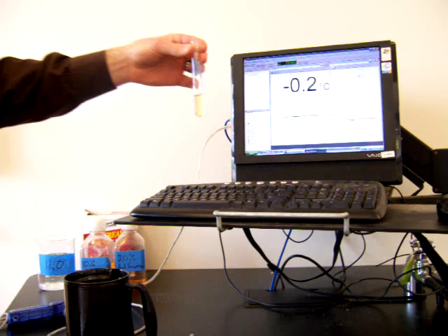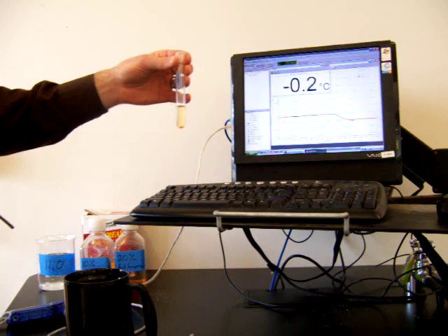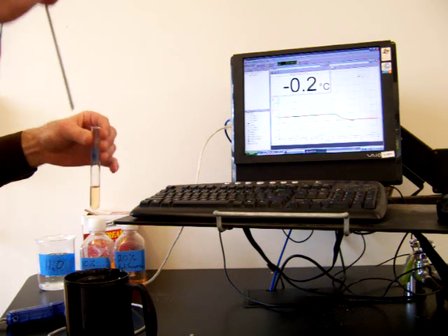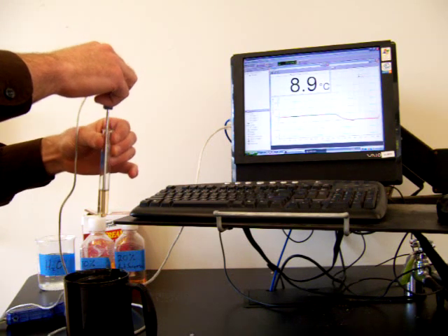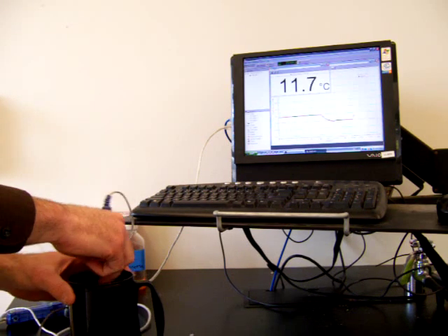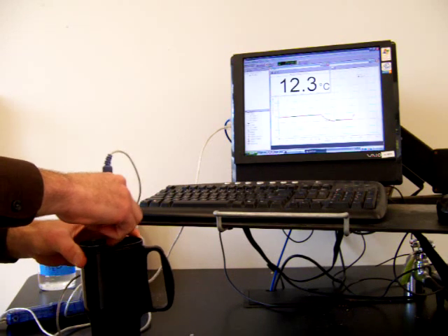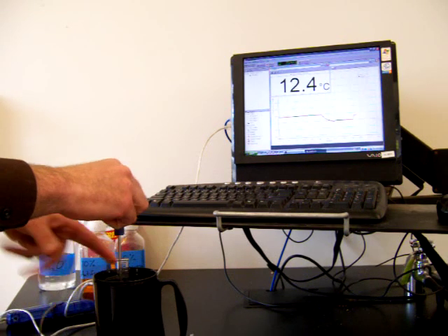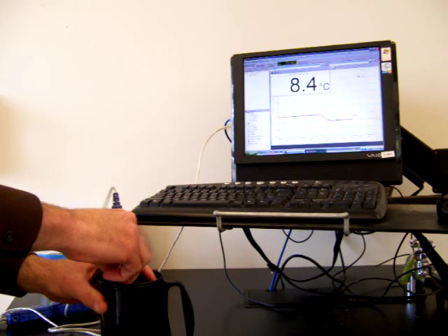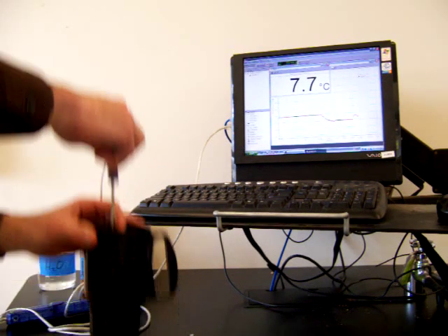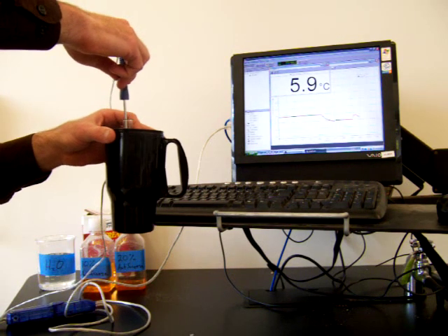So now I'm going to take my 10% antifreeze solution. This was made by dissolving 10 grams of antifreeze in 90 grams of water. And I'll put this one into the ice pack. And we're going to see at what temperature this one freezes.